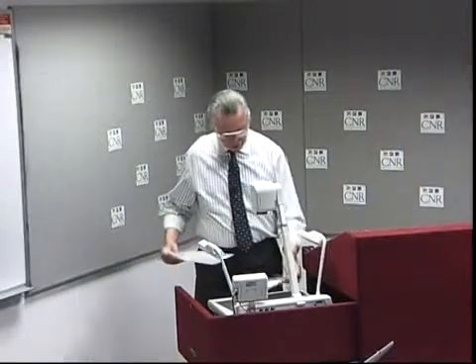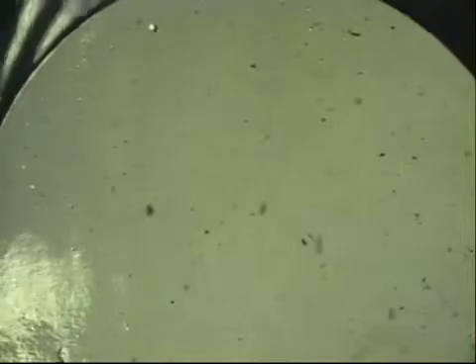There we go. This is a typical handsheet that was produced on the POMAC. This can be used, as we showed you before, in the image analysis to count all of the Stickies. The laminator is used to heat the Stickies and produce another sheet that is from the process. This contains only those materials that stuck to the laminator. You can place this directly on the scanner and measure it just like we did the wet hand sheet.